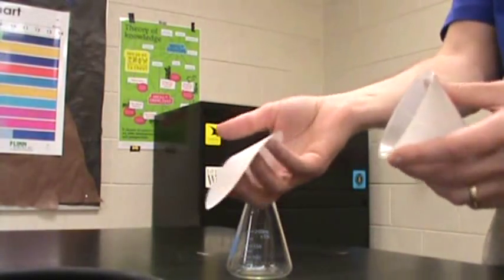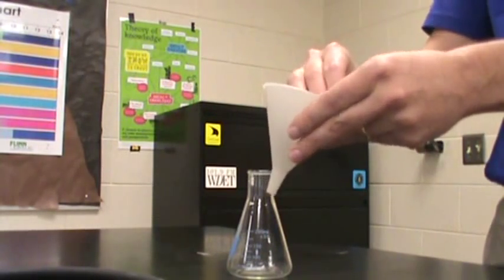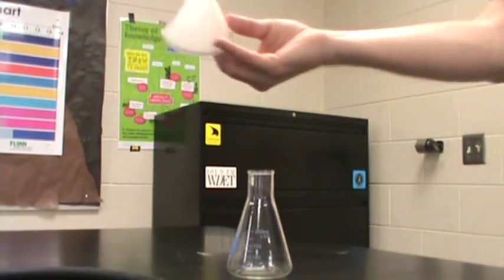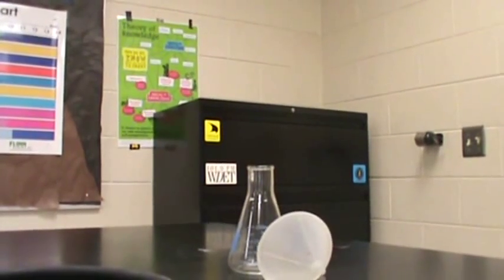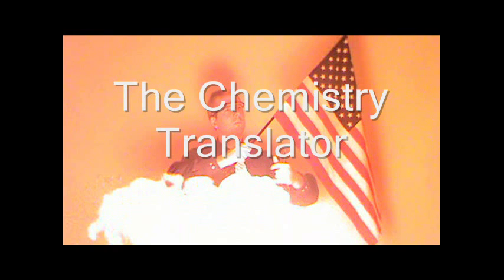If you let it go, it will pop back into shape, but if you put it back in really quickly, we've got our cone back. If you want it to stay, just add a drop of water to it, or add a little bit of water to the bottom, and then it'll take that shape and hold it. And that's how you fold filter paper like a champion.